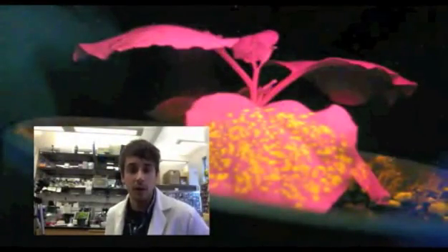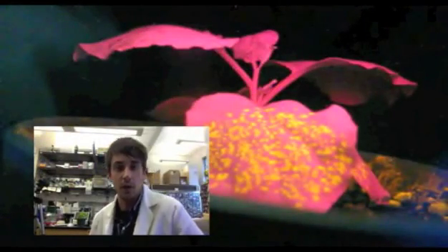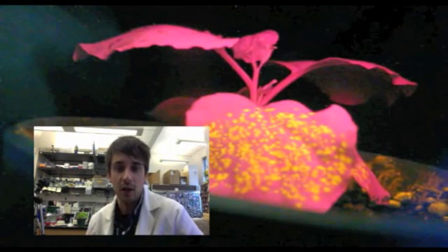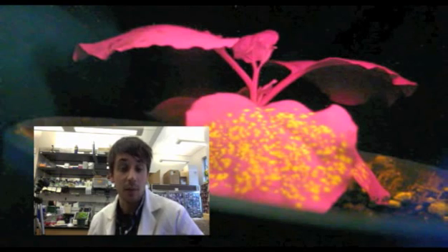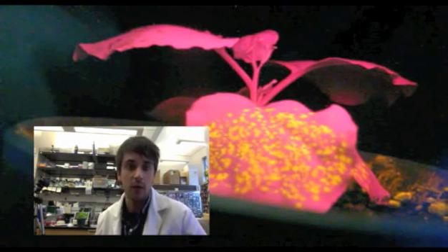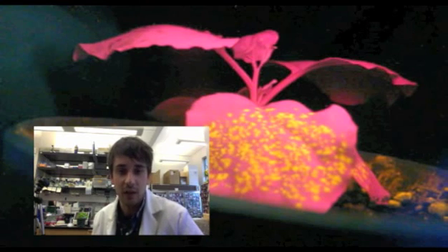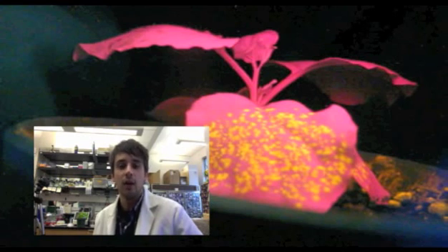Cool. So again, this is a benthy plant, or Nicotiana benthamiana, and you can see that benthy kind of glows that pinkish color. And so there are some pigments or molecules within the plant that will fluoresce or glow in that nice red color. But if the molecule that we attach glows yellow, which it should, we can see our protein. And if you see that leaf right there that we infected, there's a bunch of teeny tiny little yellow dots on there. So maybe that's our protein, maybe our experiment works.